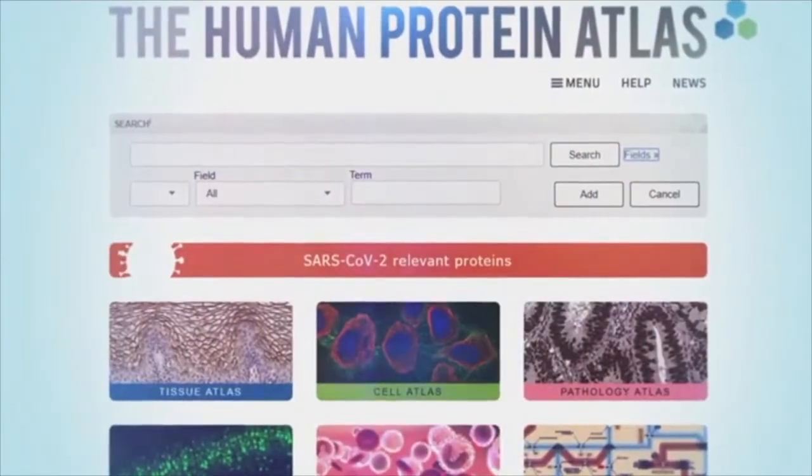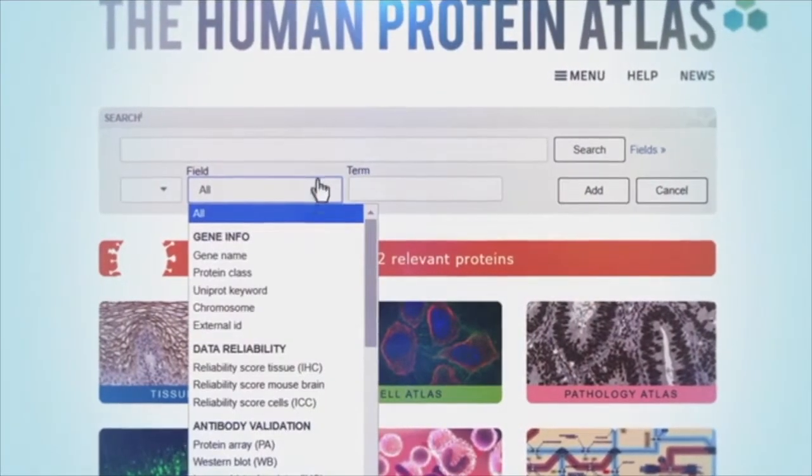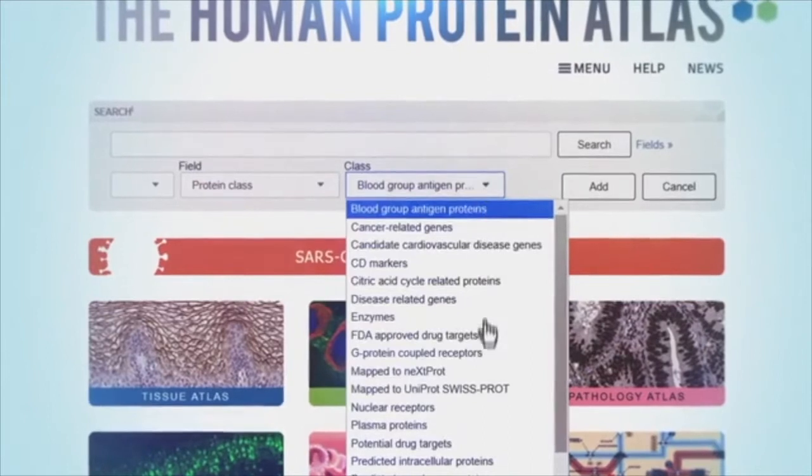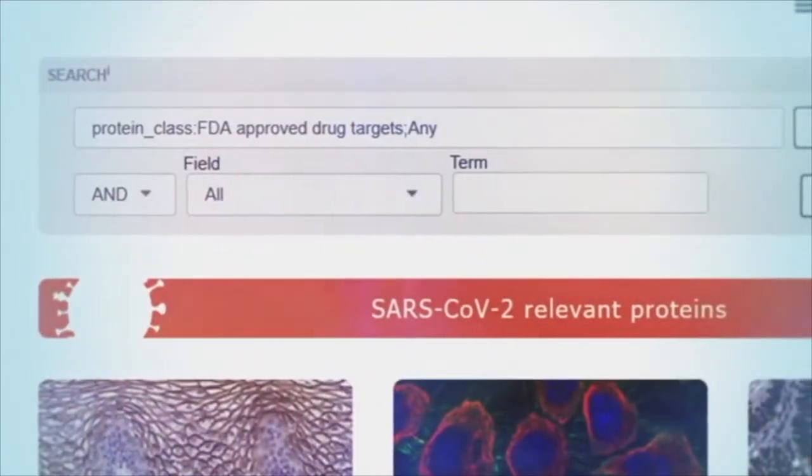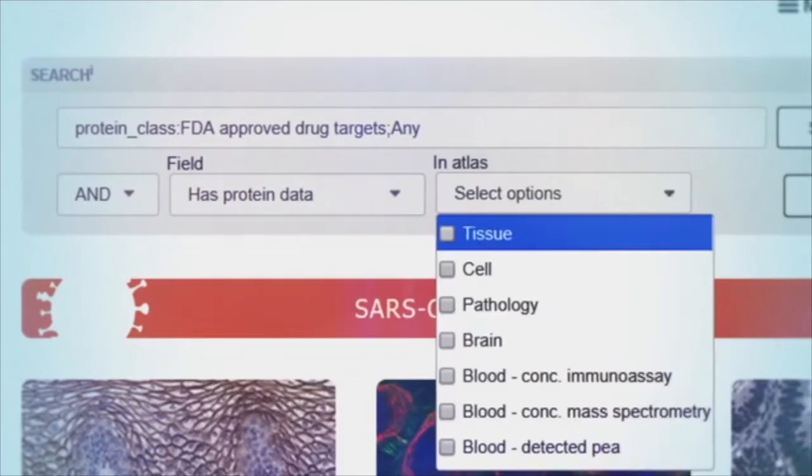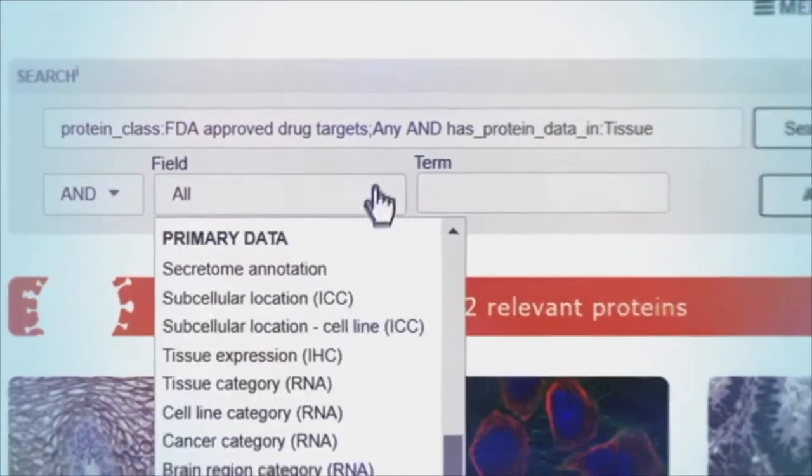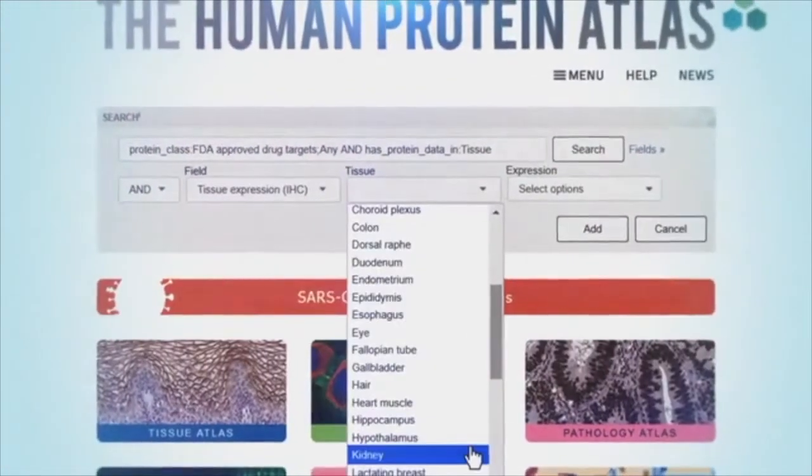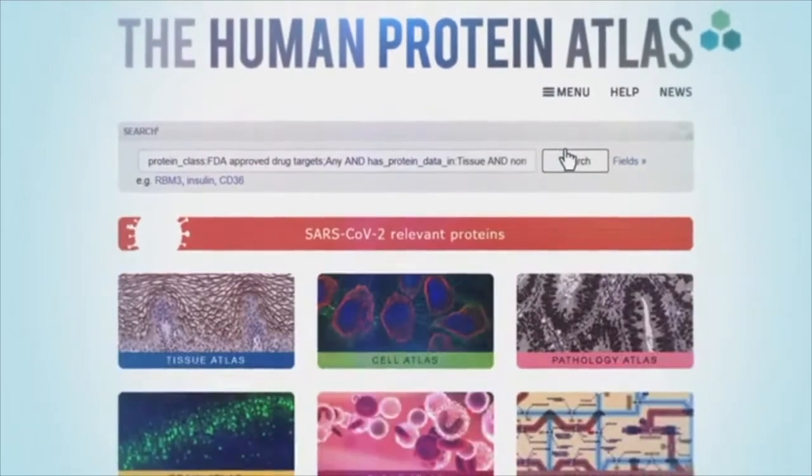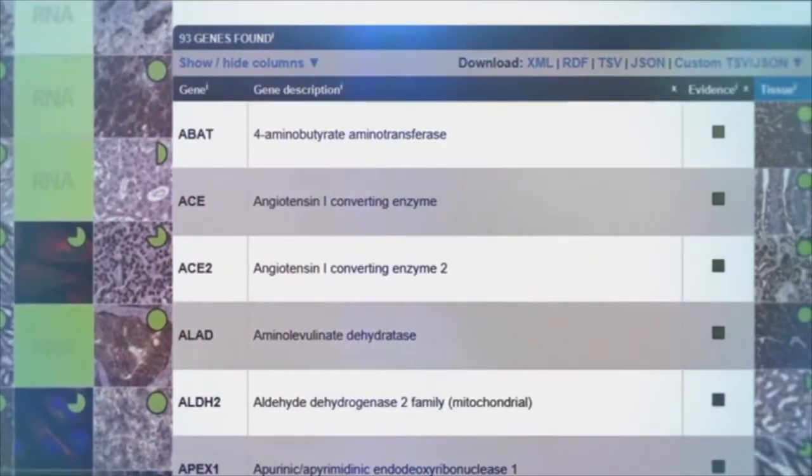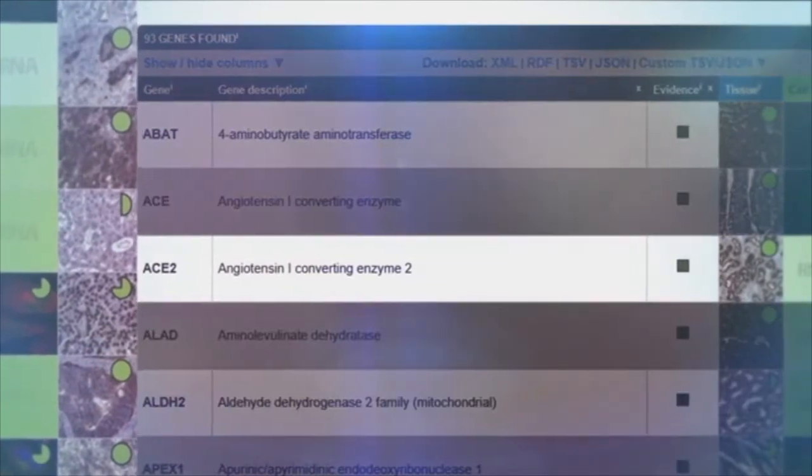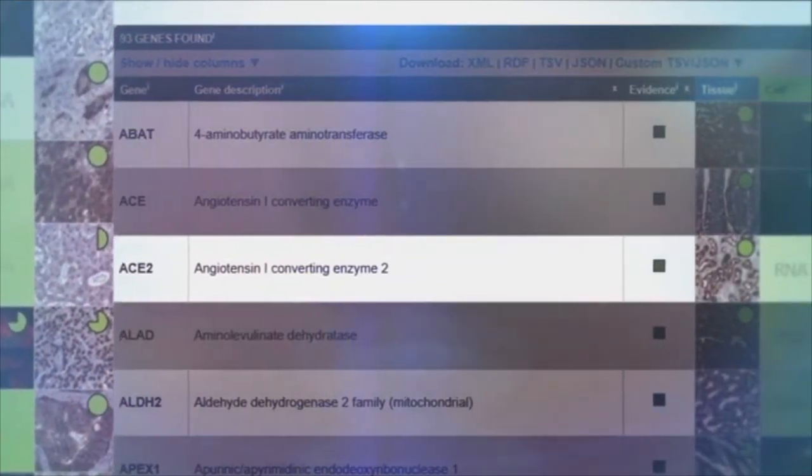The search function on the home page can be used to make simple queries like finding a protein by name or more complex ones, like FDA-approved drug targets with data in the tissue atlas and with high expression in a certain cell type in the kidney. This gives us 93 hits, with the third hit being the receptor for COVID-19.